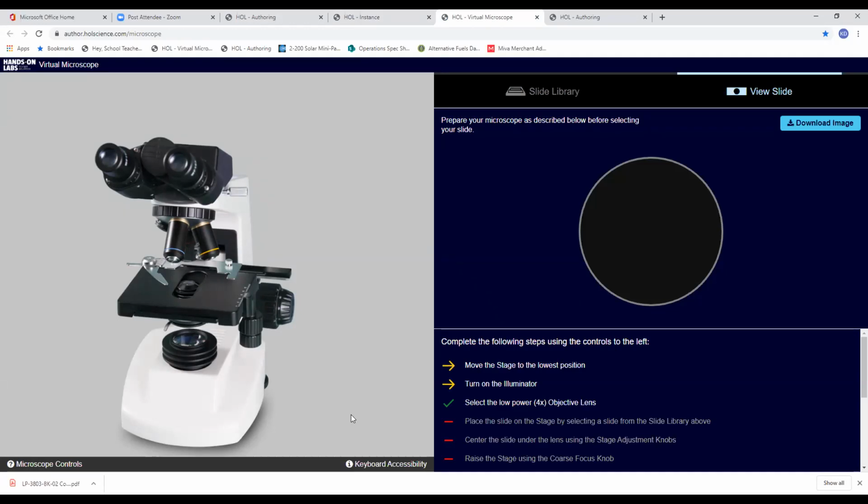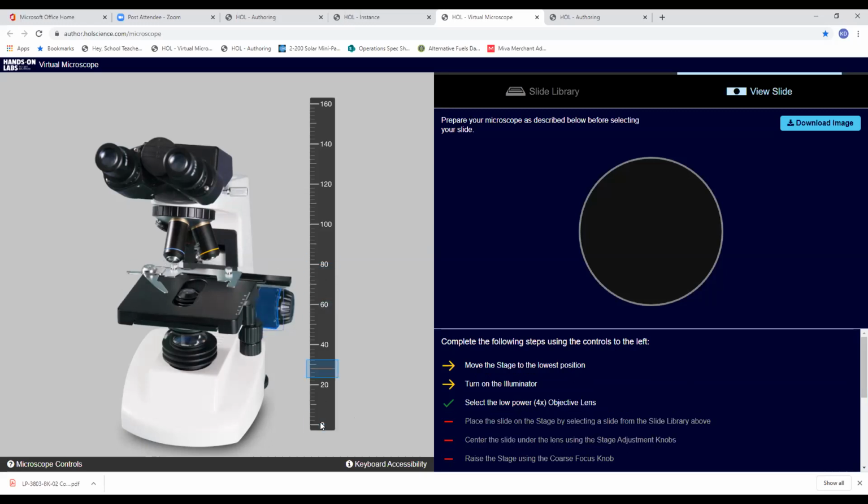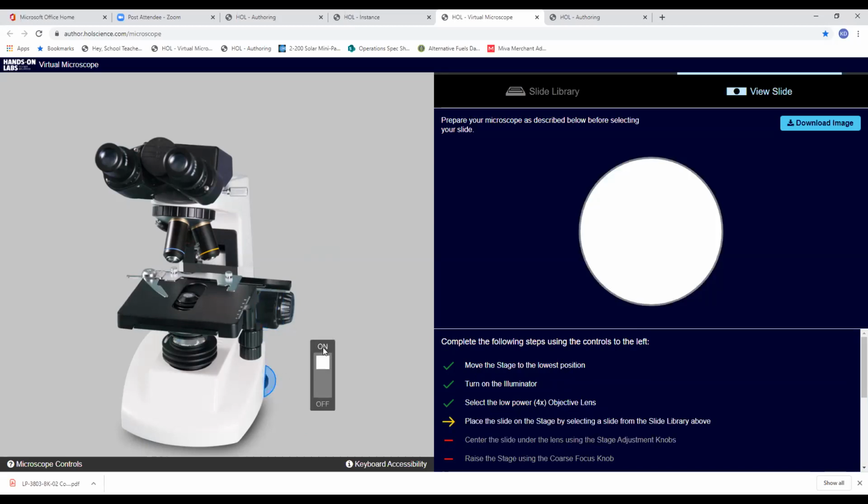Students are required to manipulate this microscope exactly like they would if it were real. We provide that prerequisite lab that we talked about early on, and then we've got some cheat sheet steps for the students should they have forgotten what was covered, to make sure they realize the proper sequences of focusing, using slides, and capturing images. For example, we have to lower the stage on a real microscope in order to move slides on and off safely. We need to do that on the virtual microscope also. We obviously can't view a slide until we turn on an illuminator. Then we should always have the lowest power objective selected before we place a slide on the stage.